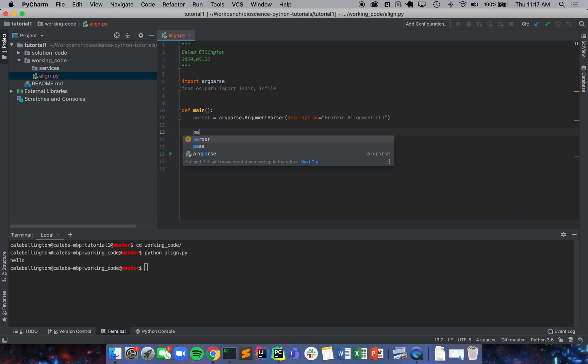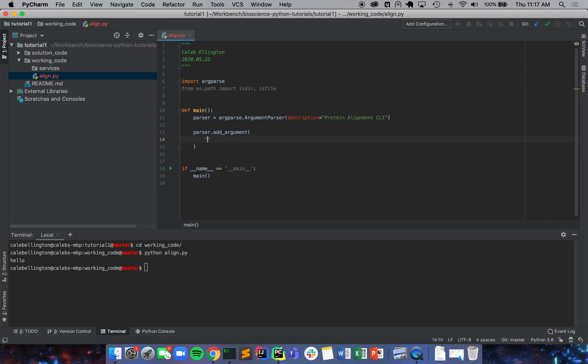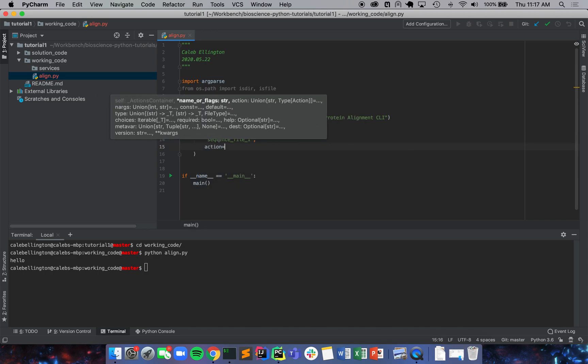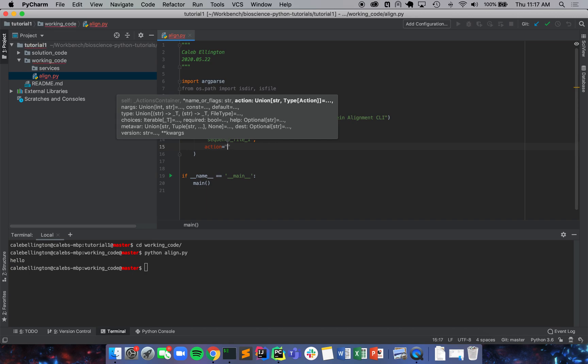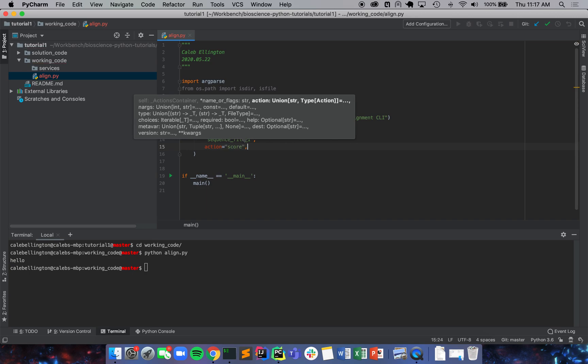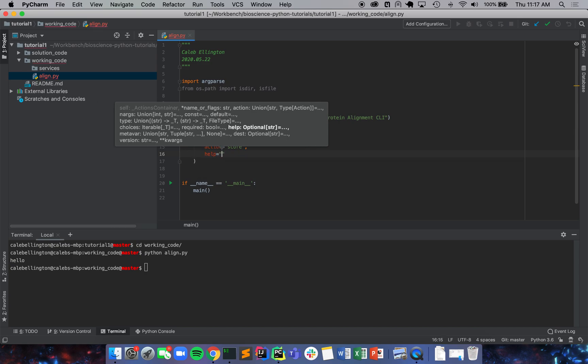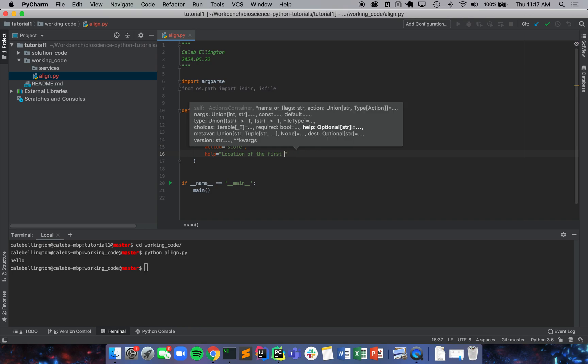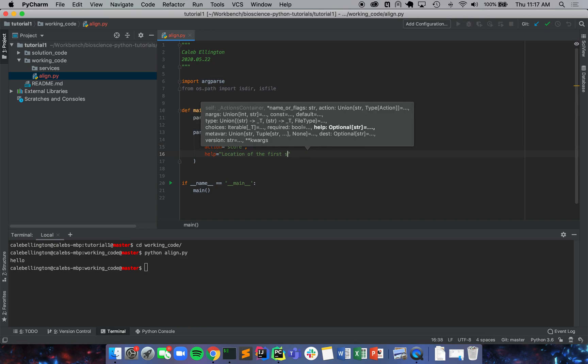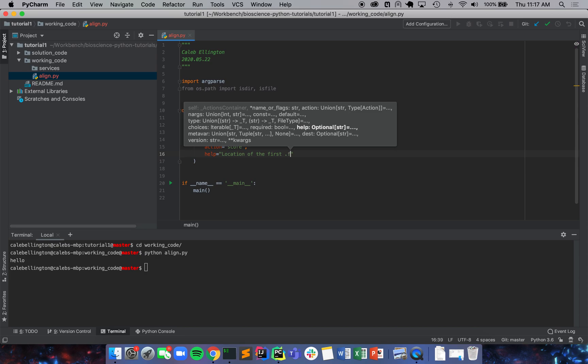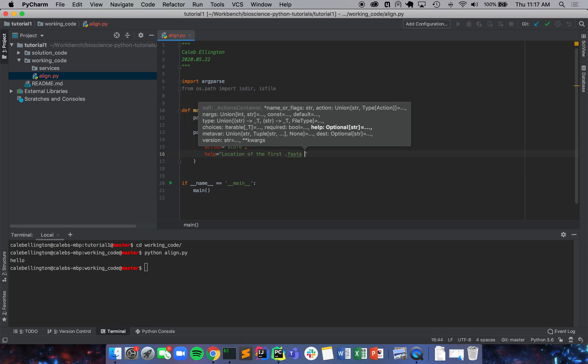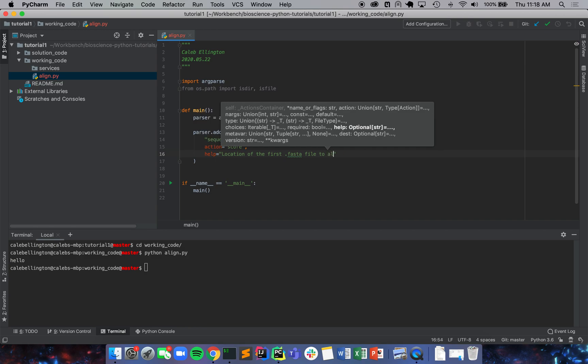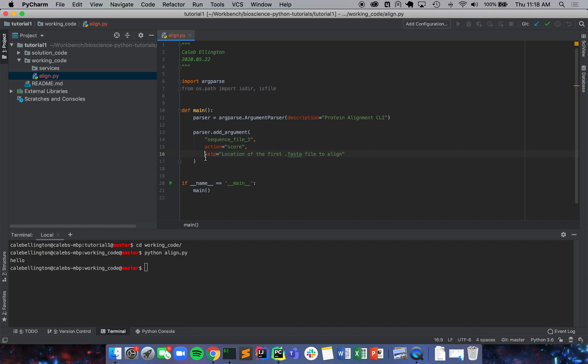And now we're going to add our arguments to our parser. So parser.add_argument, and we're going to make this sequence file. I'm just going to make this file one, and it's going to be a required argument. And we're just going to store that argument for later. And then if your users need help, I'll just say location of the first file sequence, say FASTA. FASTA is a commonly used sequence file type. So we're just going to say the location of the first FASTA file to align. Great.